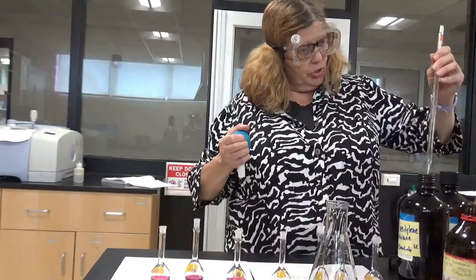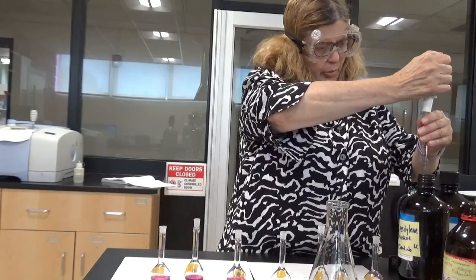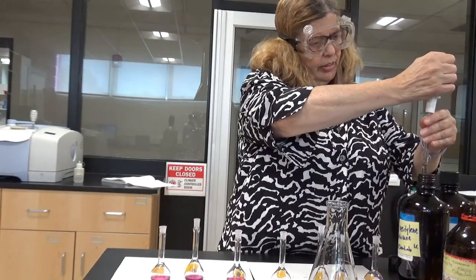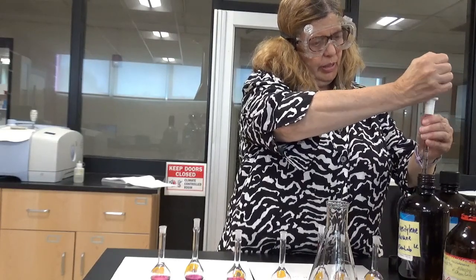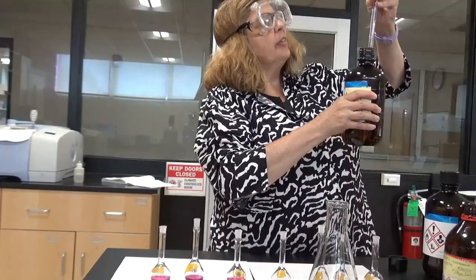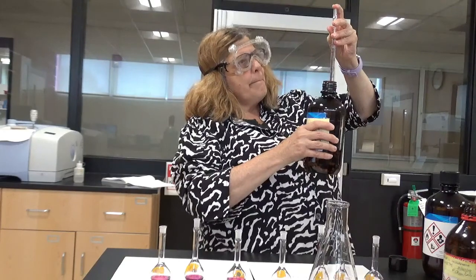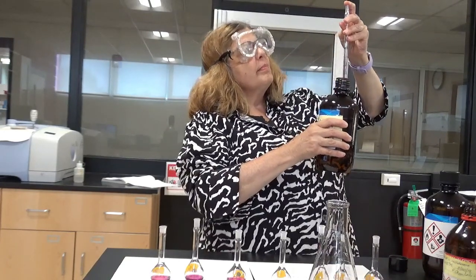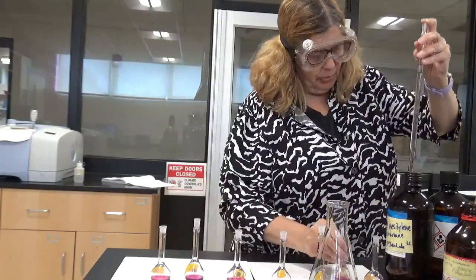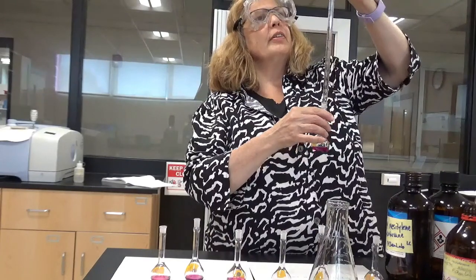So now I'm going to put 2 milliliters into the next solution. But I think I'm going to fill my pipette because I'll be able to do at least 2 or 3 solutions at once with this graduated pipette. Let's see how this goes. We'll go down to the 0. Okay. The first one I'll put 2. Can't go very far into this.